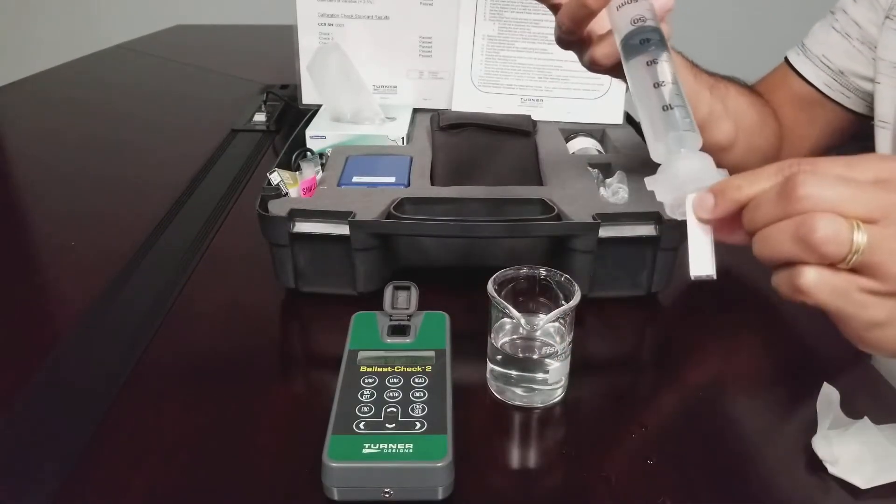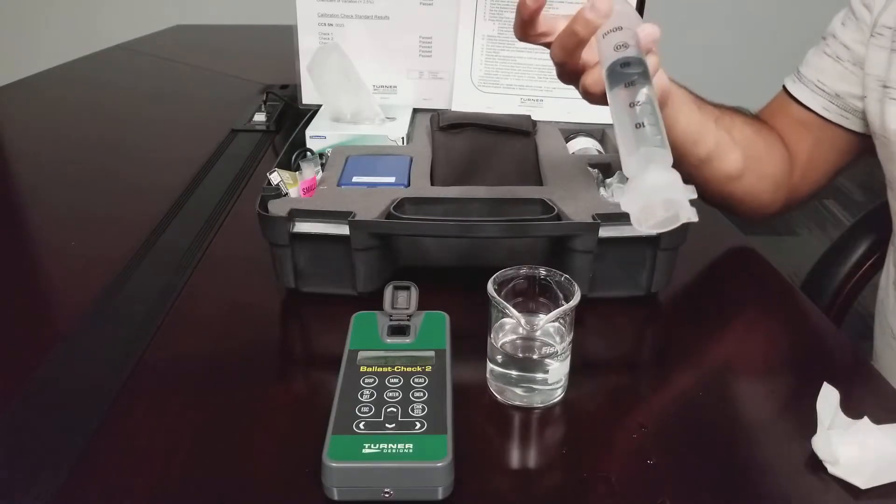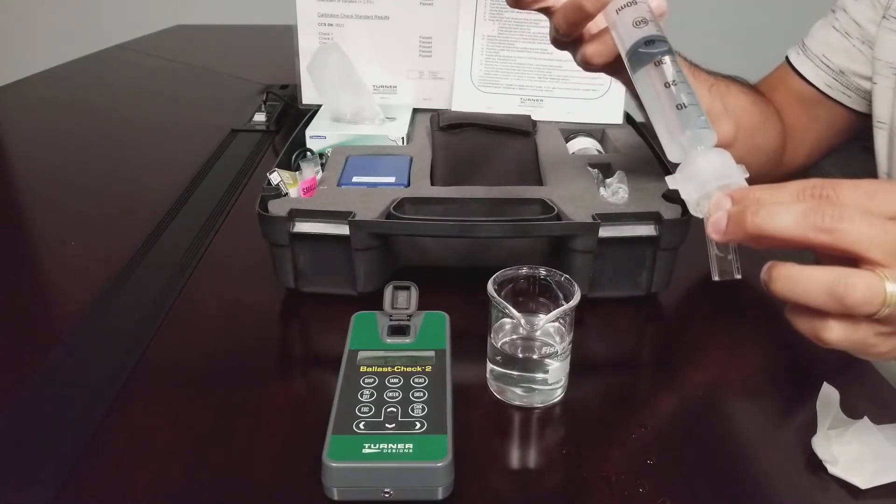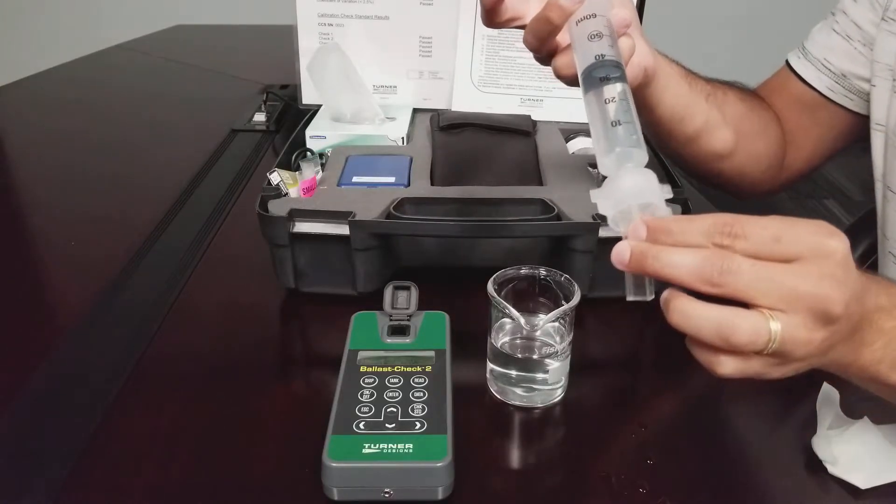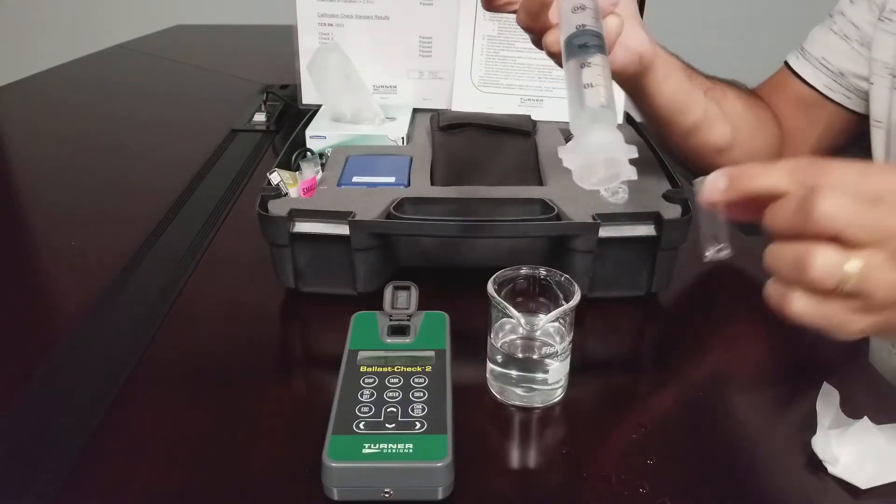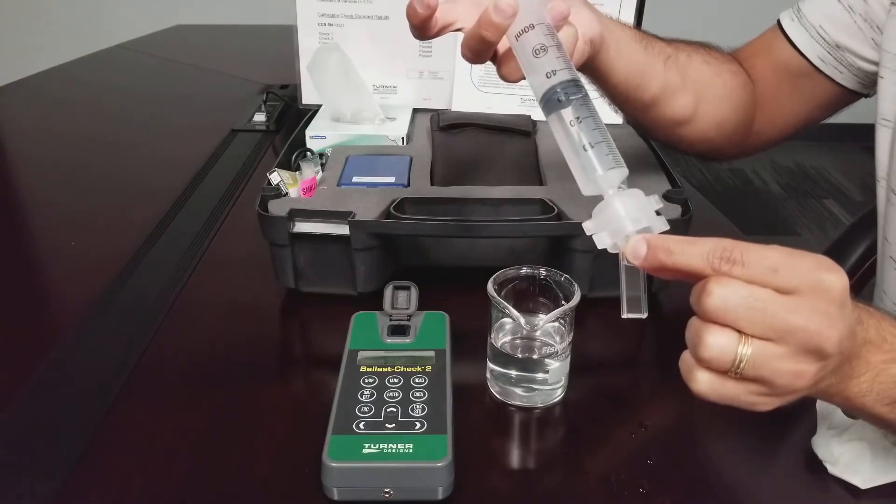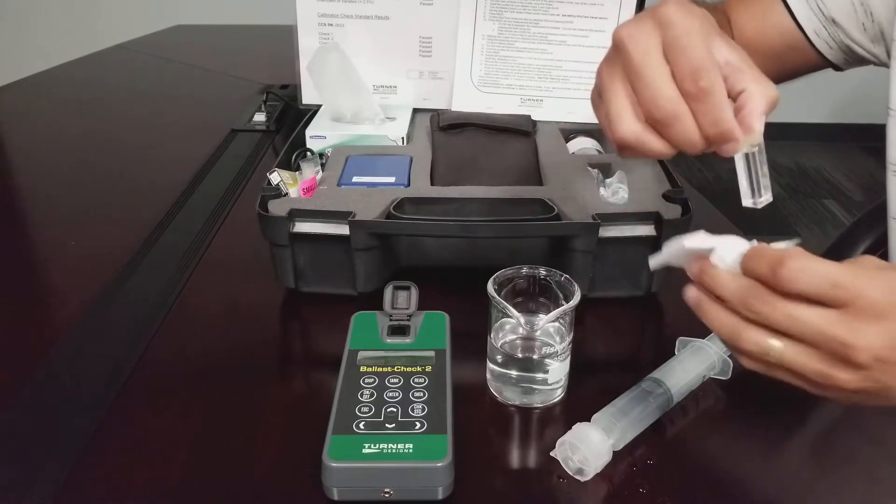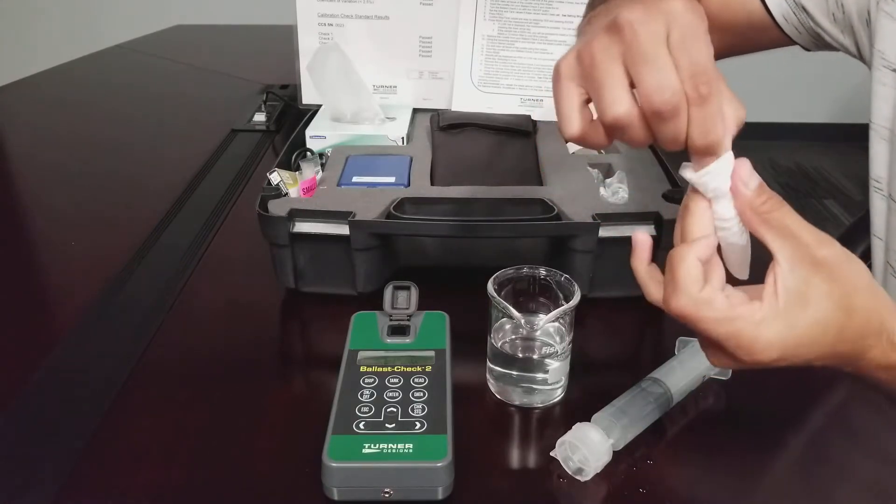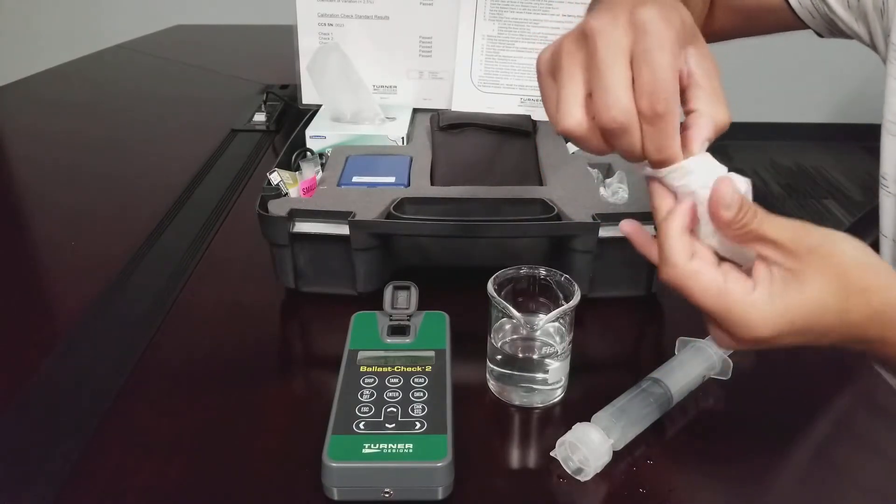Rinse the cuvette 3 times using the filtered sample. Then fill the cuvette 3 quarters full with the filtered sample. Use a kim wipe to wipe down the sides of the cuvette, wiping away any moisture and fingerprints.